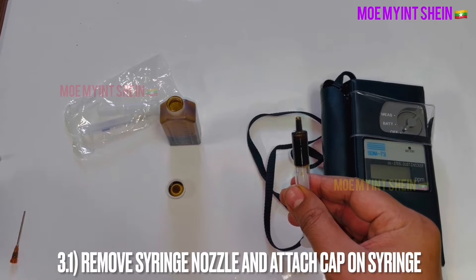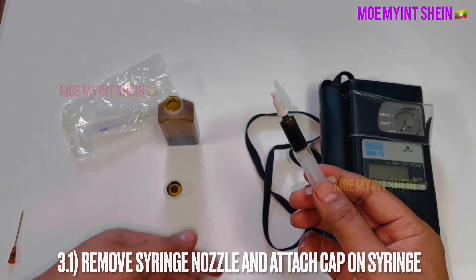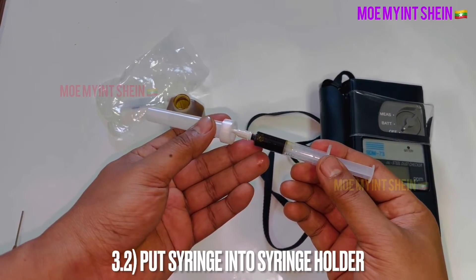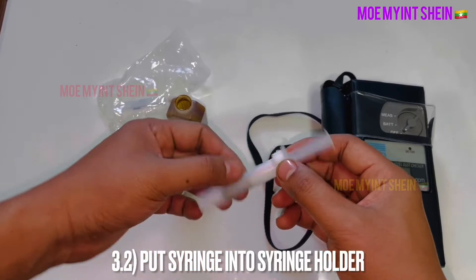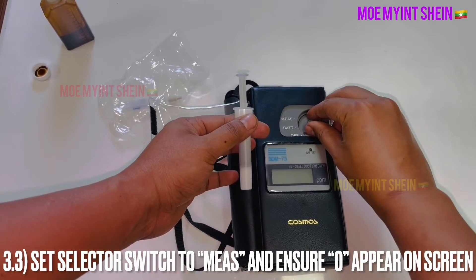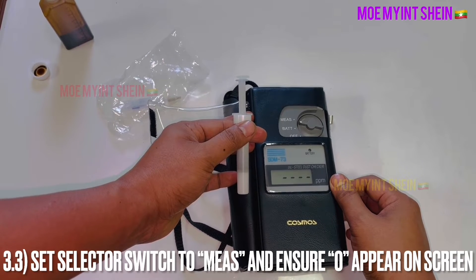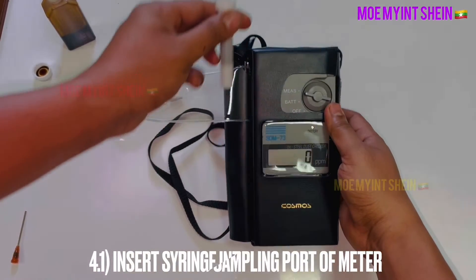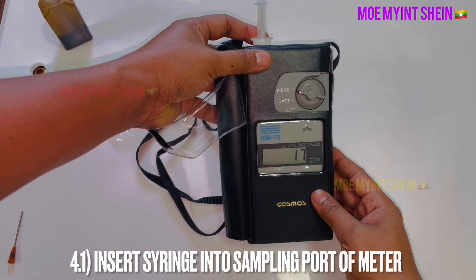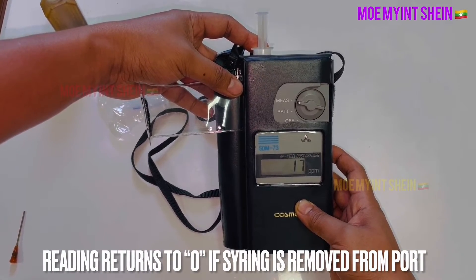After air is purged from the syringe, remove the nozzle and mount the cap. Put the syringe into the holder. Then set the selector to measurement and confirm zero appears on screen. Insert the syringe into the port of the meter and record the value on the display. The reading will return to zero if the syringe is removed from the port.